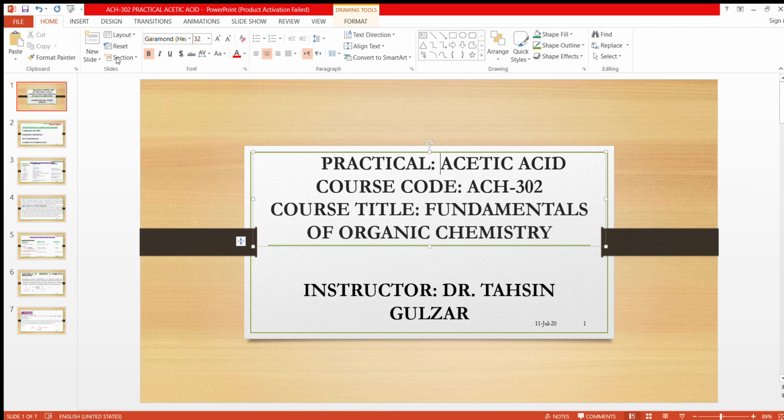Now write down in your journals, neat and clean, with a clear mind. Try to understand what the purpose of this practical is, that you should know what functional groups are and how they are identified, what elements are, and what the way is to use the naming system or nomenclature, IUPAC.